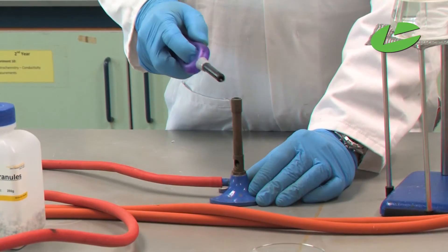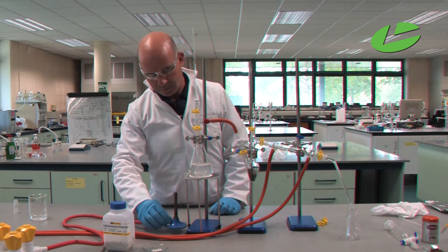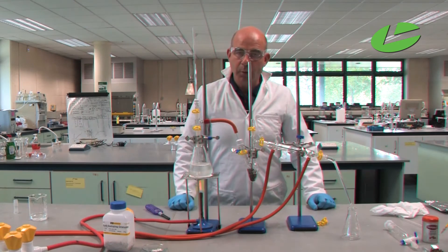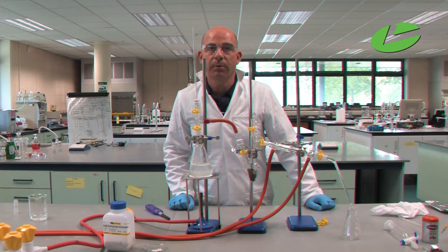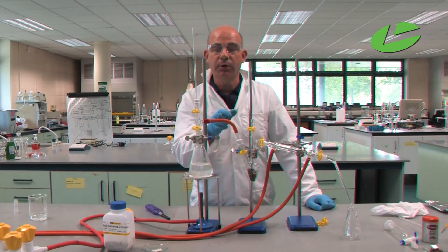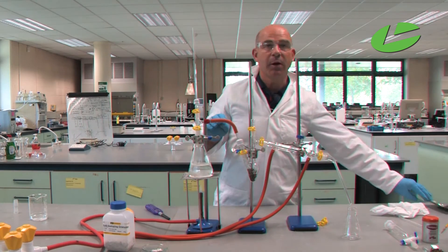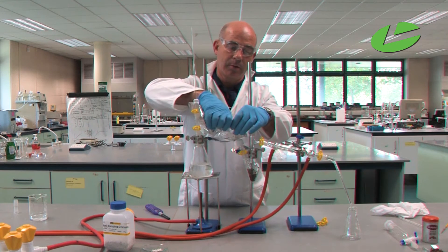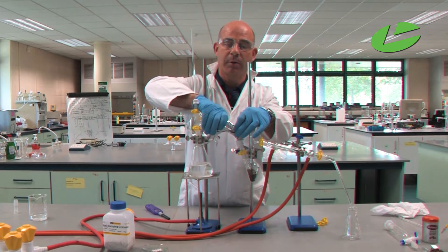First of all I need to turn on the water, then turn on the gas and light the Bunsen burner. With this practical, trying to keep the heat in the steam as much as possible makes things go a lot smoother. For that reason I'm going to insulate the transfer tube — wrapping it with tin foil from here to here — that will help insulate the steam and ensure the reaction goes a little bit quicker.